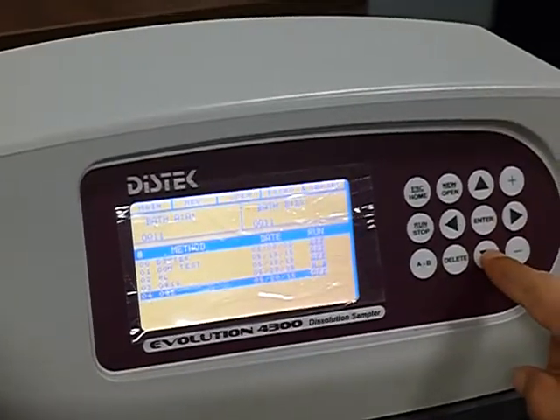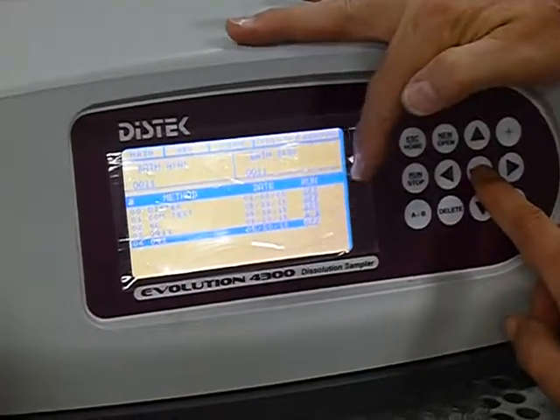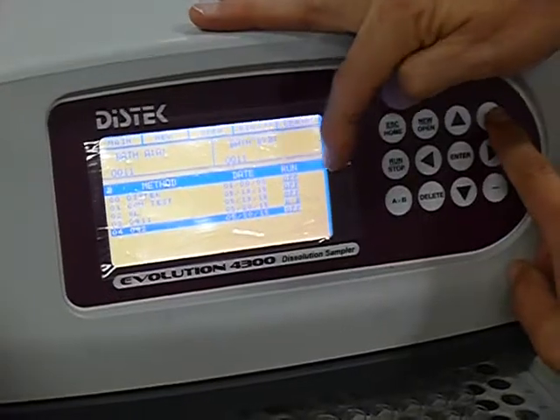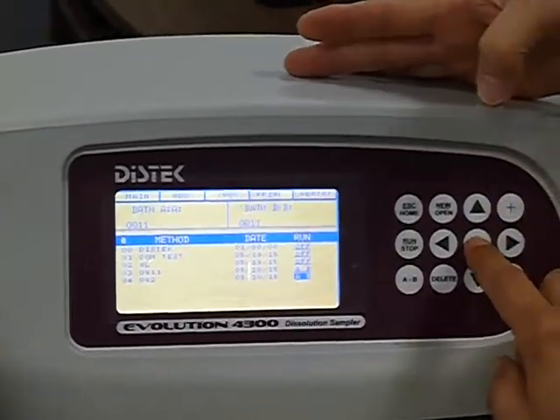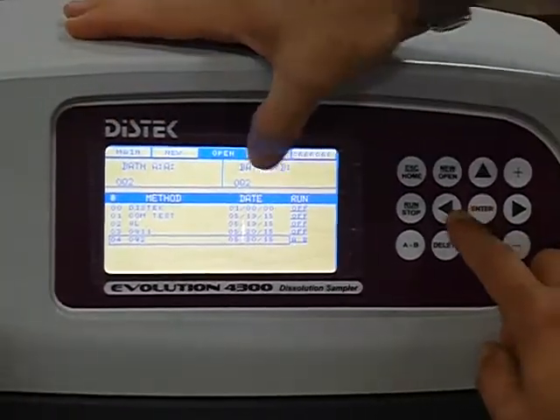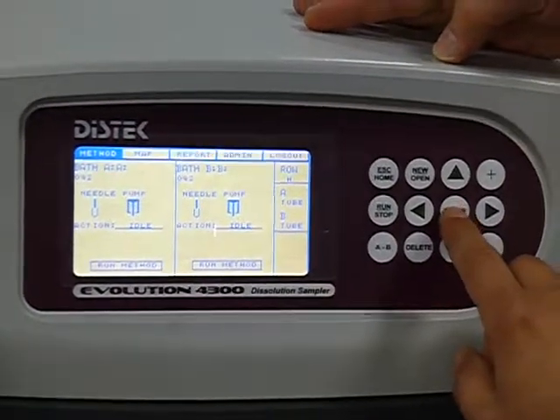And then go over to the base where it says to run. It needs to know which one, so you've got to hit an arrow yourself over to where it says off. Okay, then toggle to where it has both A and B. And then when you hit enter, it loads it. Then you can go back, see, it's already said OQ2, then you go back to the main, Enter, and it's there.